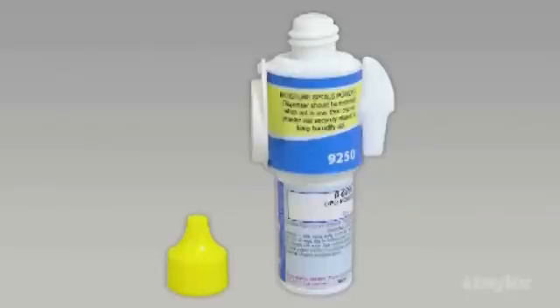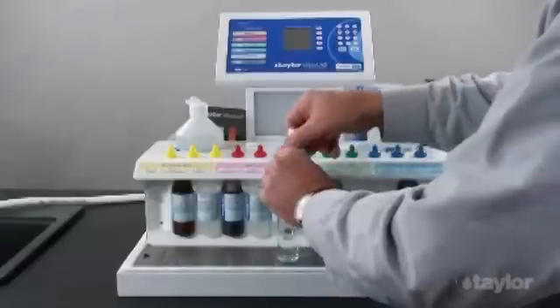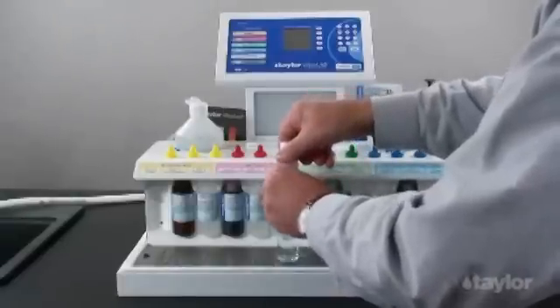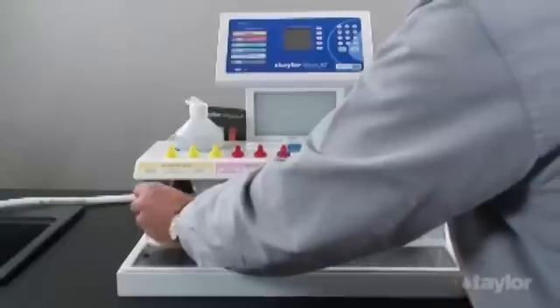Remove the cap and invert the dispenser. Next, turn the handle once to fill the cavity with indicator powder, and then turn the handle in the opposite direction to dispense the powder.